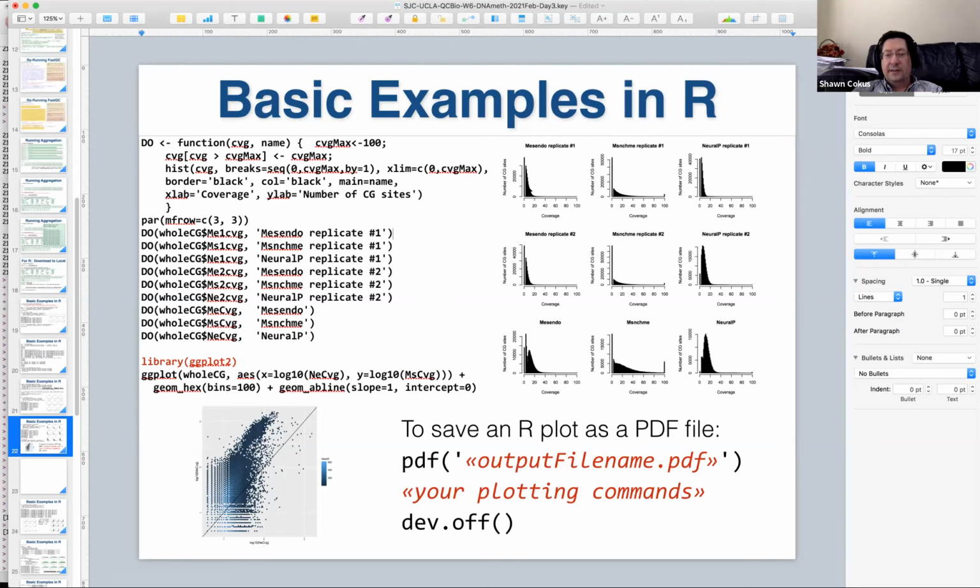Ideally, you don't have anybody hugging the left axis in whole genome bisulfite. Ideally, nobody hugs the left axis, and your bump is actually isolated from the 0. And you get a little bump out somewhere, and hopefully the tail doesn't go out too far, so that's coverage unevenness. So ideally coverage would just be a spike at some number. That would be perfect. Otherwise, hopefully it would be a little spread, but a narrow spread, and apart from 0. But here we are. We're sort of in a low coverage regime, where the most common coverage is 0 probably, and then there's 1, and then there's 2, and so on.